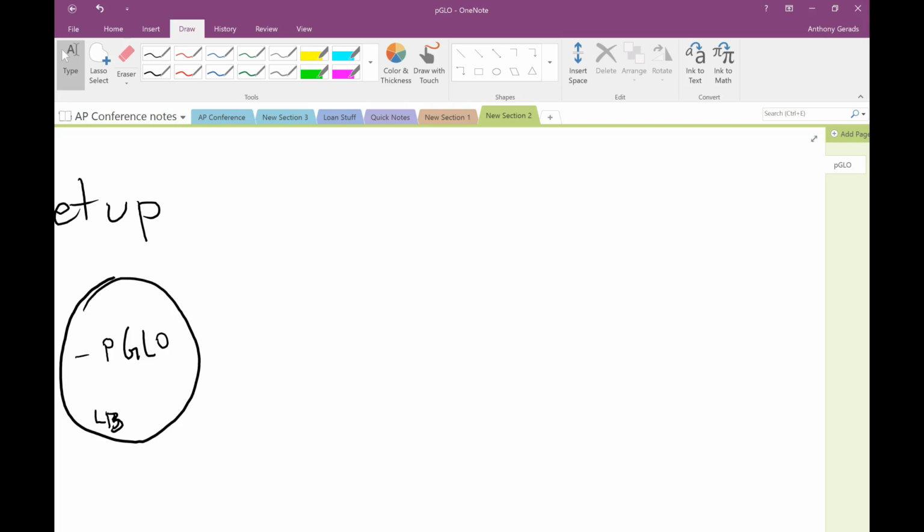So I took all this E. coli bacteria and I basically said, hey, here's hometown buffet. You're going to live here. So this one right here has no plasmid. No plasmid DNA. So I took this E. coli bacteria and put it on this plate that was just nothing but food for this bacteria.